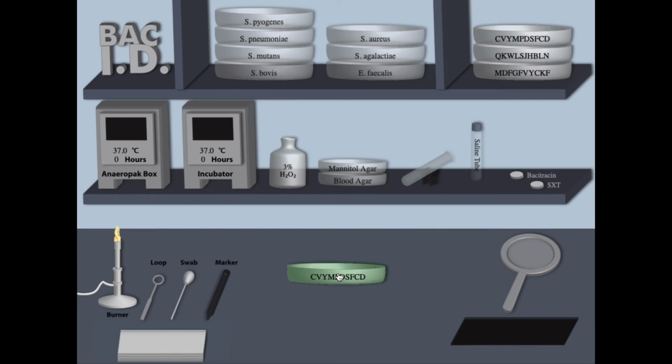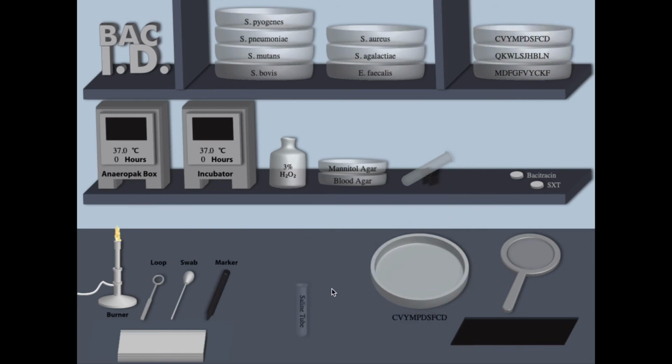Select one of the unknown Streptococcus bacteria samples from the shelf and repeat the procedure to identify the unknown bacteria.